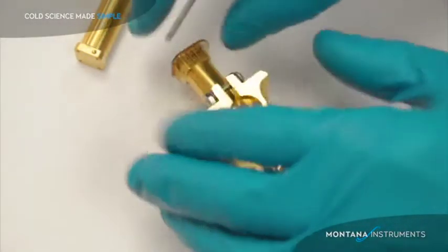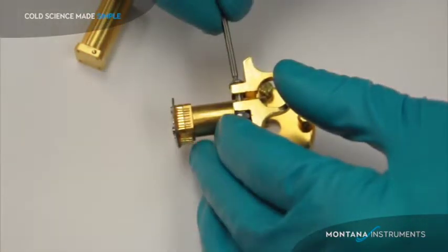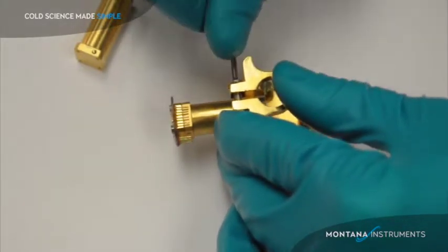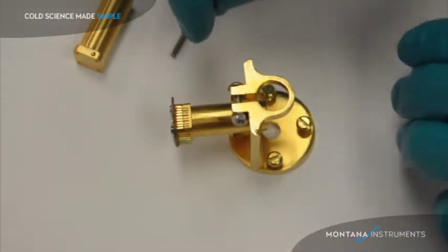However you mount it, be sure you tighten down this bolt to hold it in place firmly. It's important you have a good mechanical connection between the grip bracket and the post to provide good thermal cooling.